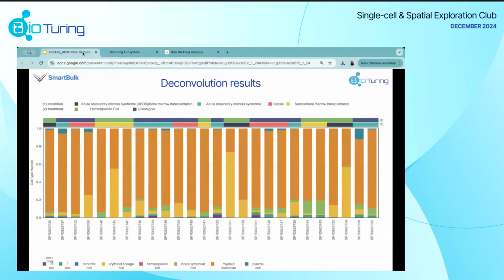So what can we see from these results? We're able to see that there are different proportions of different cell types within these different patient samples. And what you can do is add different layers to that clustering heat map, so you can see the patient sample variation. Is it specific to one patient or across different patients, so that you can see if you have a significant number of patients? You can look at that through the heat map.